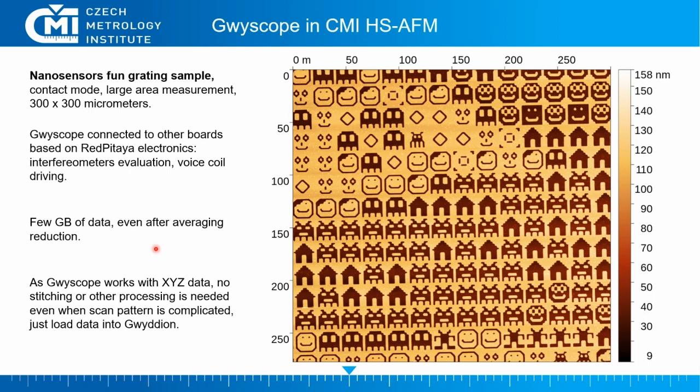So the range of this image is 300 by 300 micrometers, not meters as shown here. That would be another dream. So it's 300 by 300 micrometers.